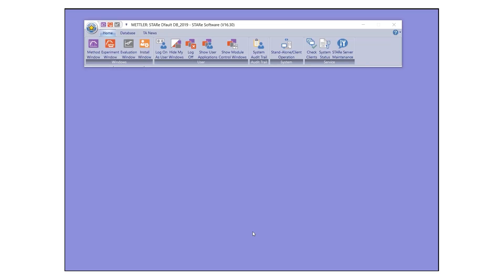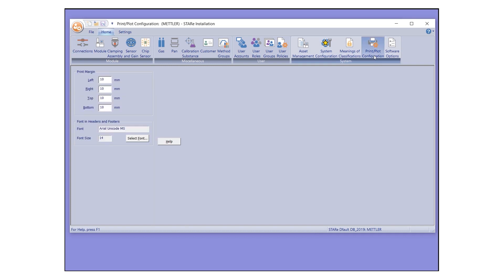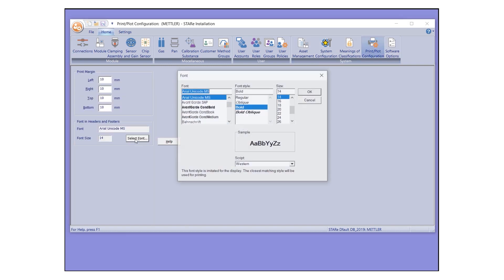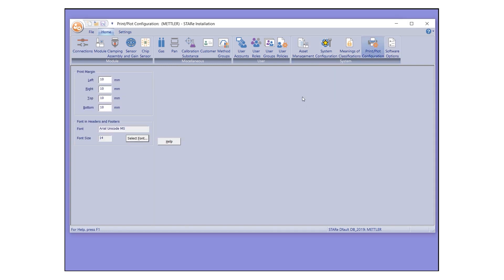The desired printing style and fonts can be defined under Settings in the Install window. Under the Home tab in the Install window, select Print Plot Configuration. Here, you can define the paper margin for printing and fonts used for headers and footers.